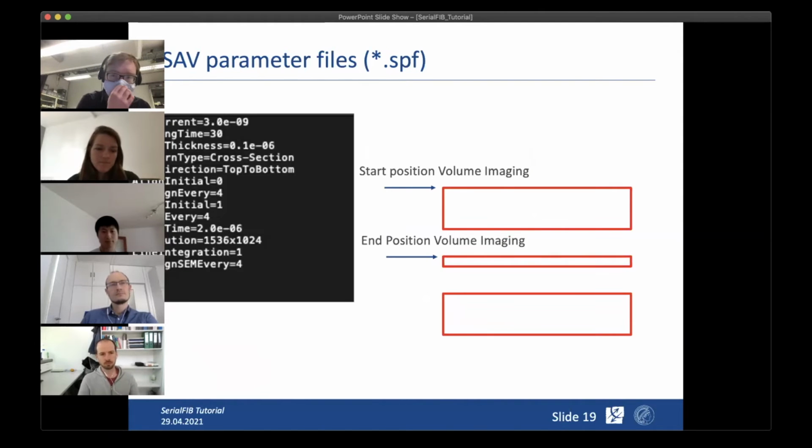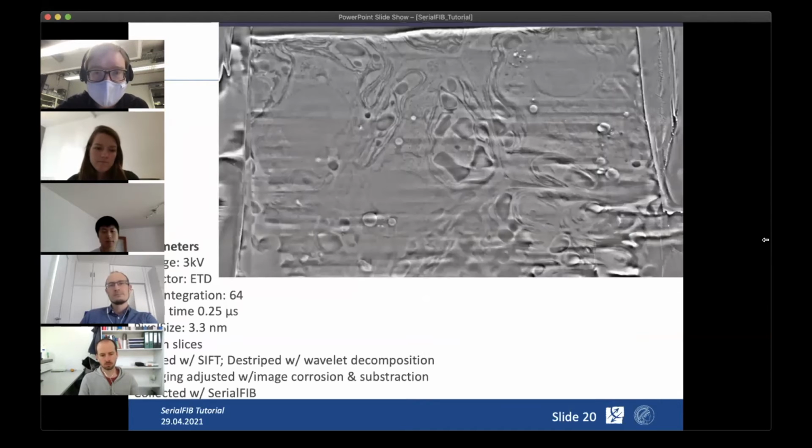And in the definition of the site, we tried to stick to this general theme of having 3 patterns, so that you could use the same patterns basically for milling your lamella after you've volume imaged them. So it starts here in the top and then ends wherever the top of your lamella pattern is, and then you can just go with the next protocol in order to produce the lamella in there.